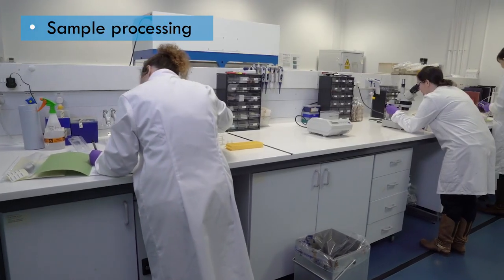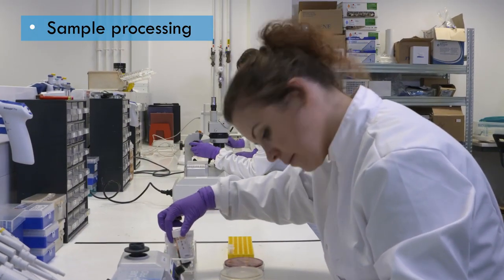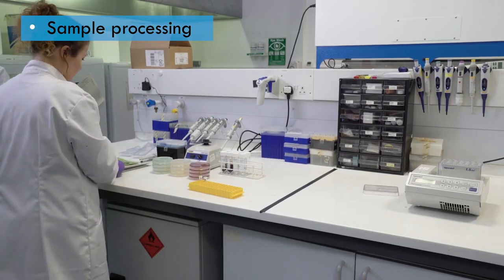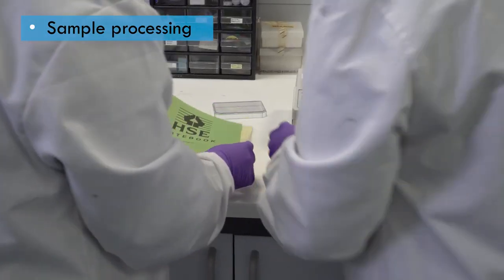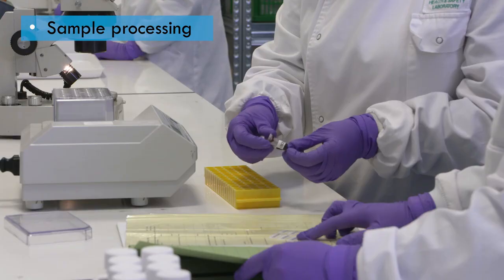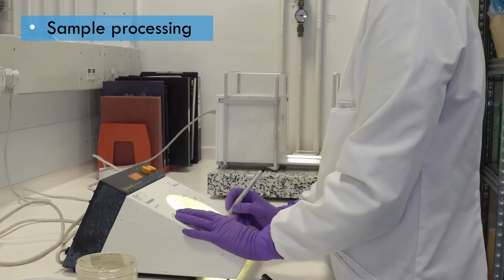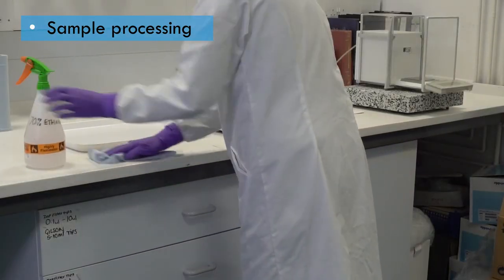Before processing the sample, make sure that the workspace is available, clean and tidy, and that reagents and other supplies are prepared and close to hand. Sign-off may be required for certain procedures prior to moving on to the next phase of the work. This will be useful for tracking the journey of the sample. When you've finished the procedure, you should tidy up and clean the area before moving on to the next process.